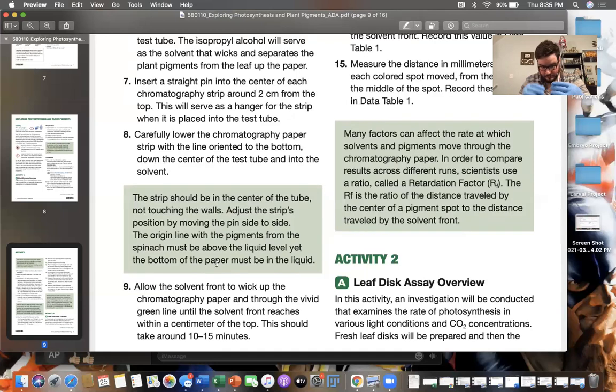Okay, so we're wicking. We got something like that. So all in all, it took about 30, like 5-ish drops, 30, depending on, I guess, how good your drops are. But just be wary of that. So we're going to let that sit for about 10 to 15 minutes.